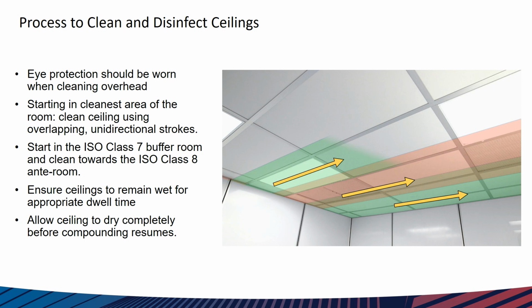So you can break that up and make it a little bit easier on your staff from a scheduling perspective, and have different areas of the room, as long as every surface is going to be cleaned and have a sporicide applied at least monthly.